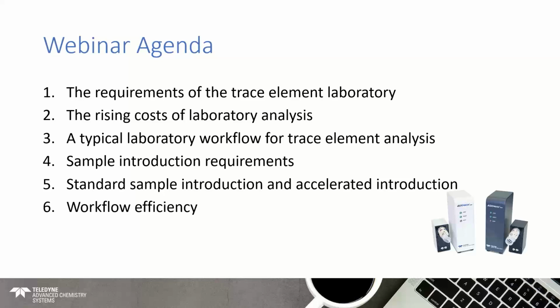This is something which has become more prominent over recent years, certainly post-COVID. Then I'll go into a typical laboratory workflow for a trace element lab, and then look into sample introduction in that workflow, and then looking at a standard sample introduction to ICP instruments, and then accelerating that introduction, and then finish it off with some discussion of workflow efficiency.